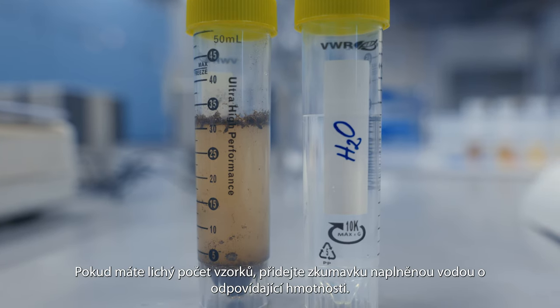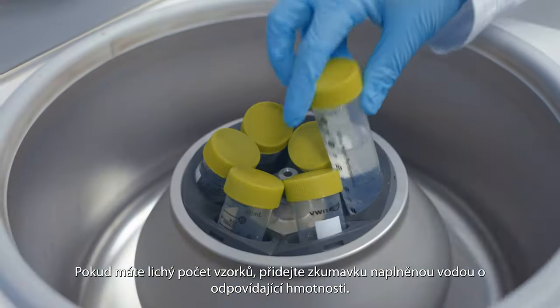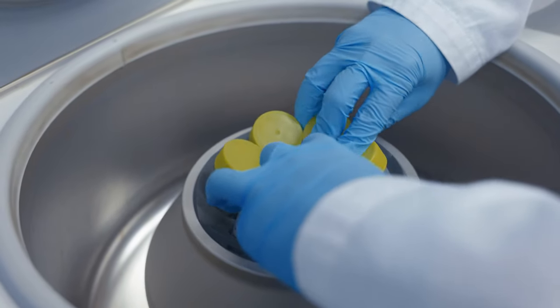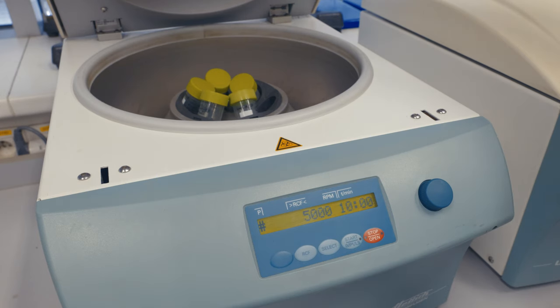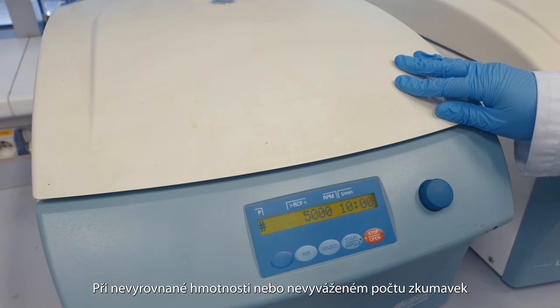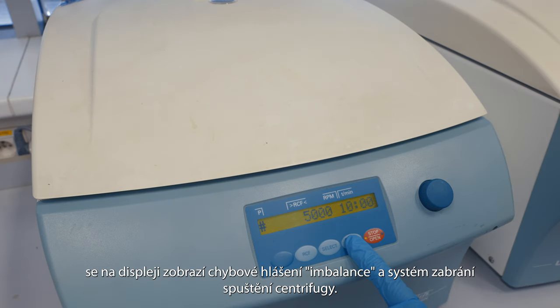If you have an odd number of samples, add a tube filled with water of the appropriate weight. If there is an unbalanced weight or an unbalanced number of tubes, the display will show the imbalance error message and the system will prevent the centrifuge from starting.